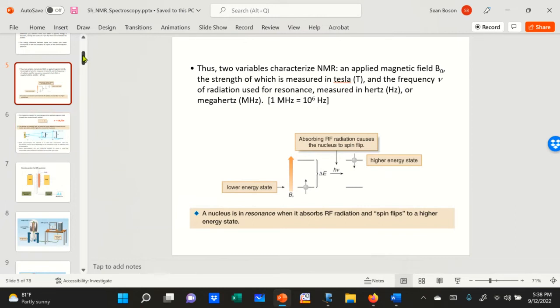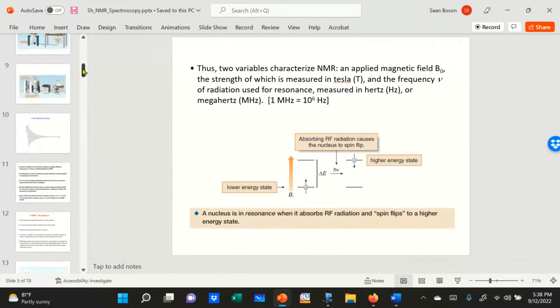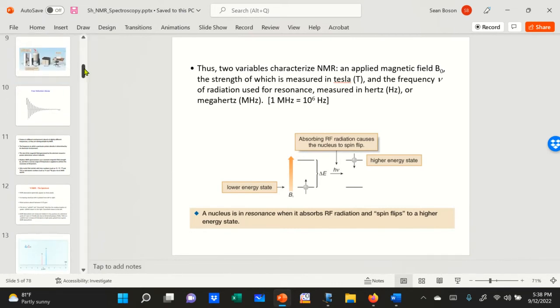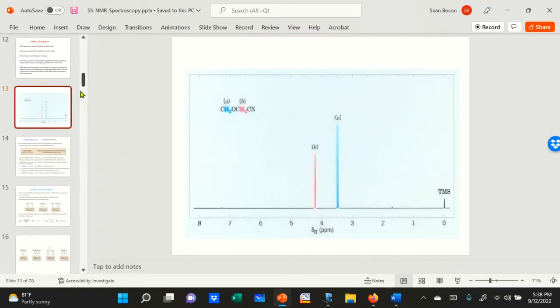You are causing a spin flip and that absorption is measured. That corresponds to the absorption signal we are talking about, and it does not create good resolution. That is the reason for this weird manner of getting the opposite data, free induction decay, because that produces far better resolution and a nice spectrum. Extremely complicated electronics goes with it.